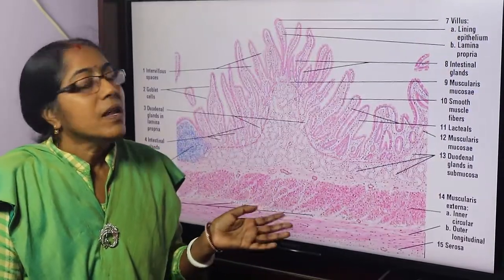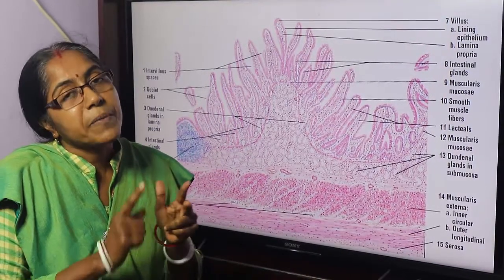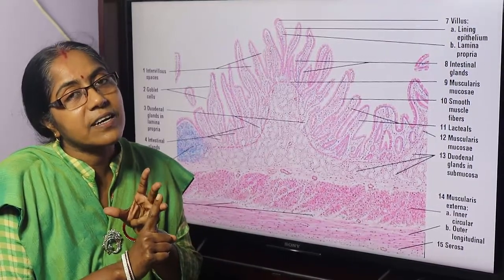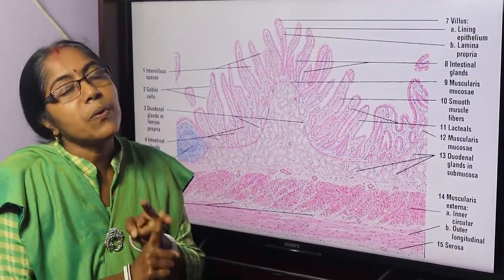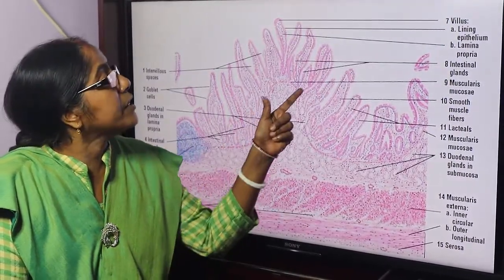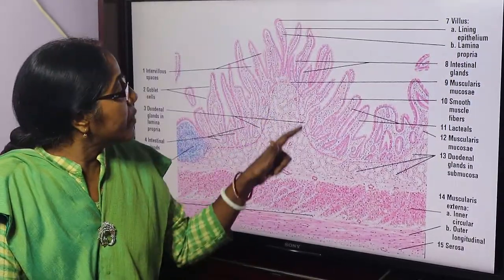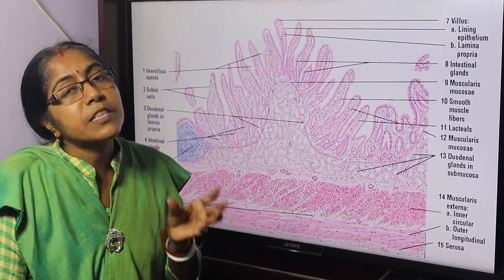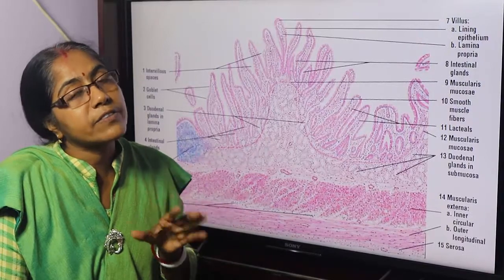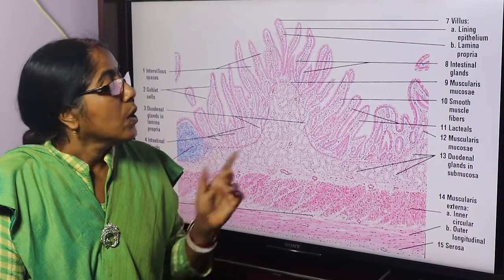First, the wall of the section consists of four parts. From inner to outer: mucosa, submucosa, muscularis externa, and serosa. Number two, mucosa is lined by simple columnar epithelium and shows numerous villi. Number three, submucosa is packed with Brunner's glands. Number four, muscularis externa is composed of outer longitudinal and inner circular layers.